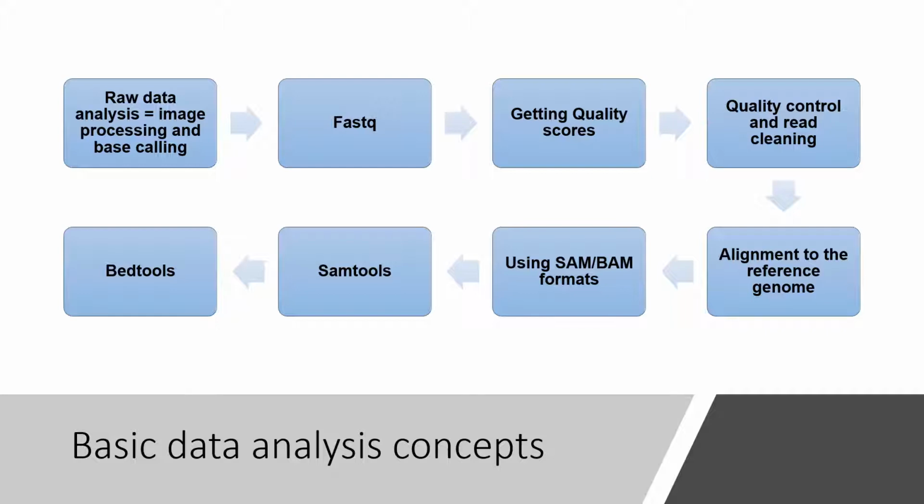So let me give you a small overview of the VCF file. The VCF file gives us key information like the format, date, the software used, and the human genome used for the referencing. Then the SNPs, that is single nucleotide polymorphisms, are clearly mentioned in the VCF file. In the VCF file you can also find the genotype, the read depth and the frequency of the genome under study.